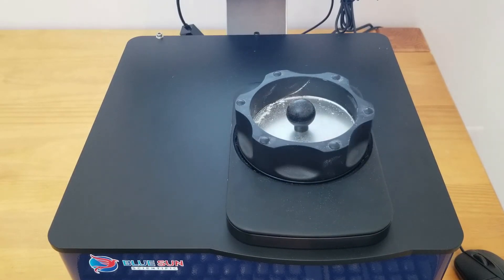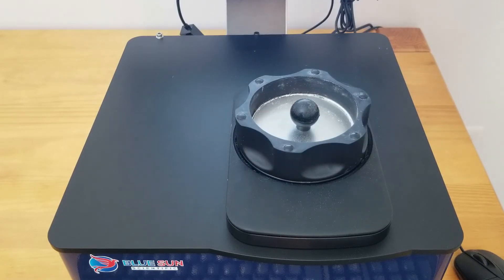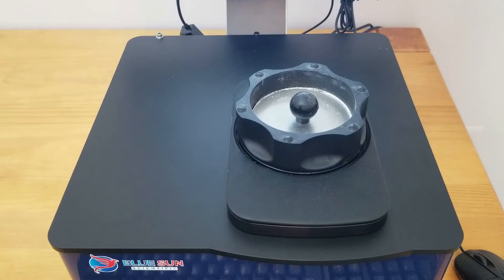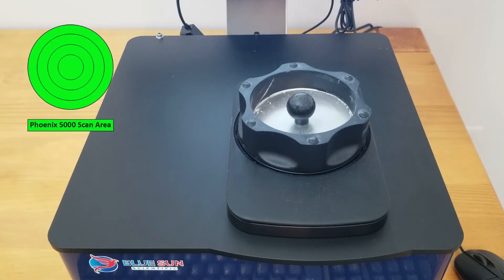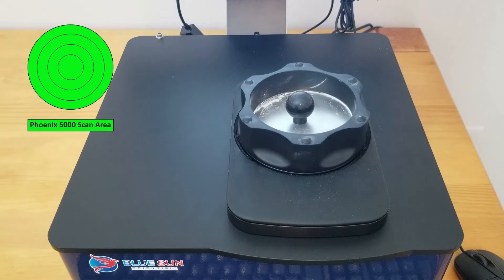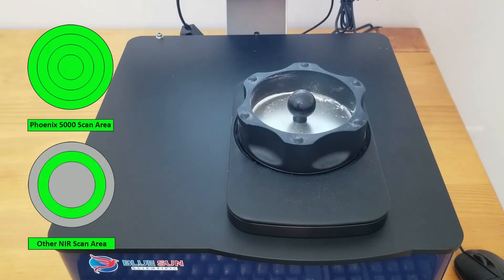A unique feature of the Phoenix 5000 is the sample card, which can move the sample cup back and forth as well as rotate it. By doing both of these movements together, the Phoenix 5000 is able to scan the entire surface of the sample cup, as opposed to a single ring or racetrack, which is all that most other NIR instruments will scan.